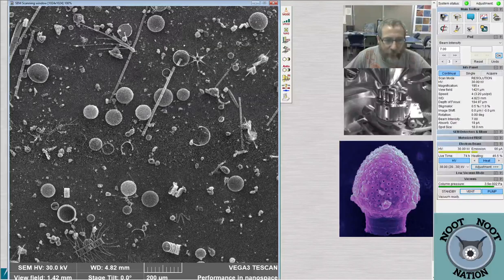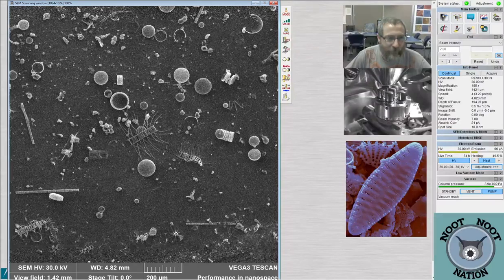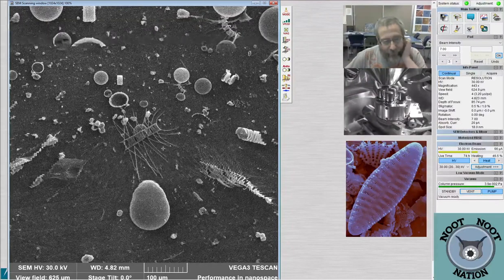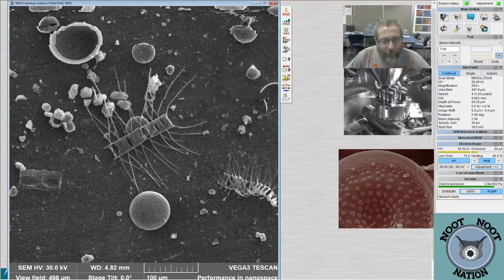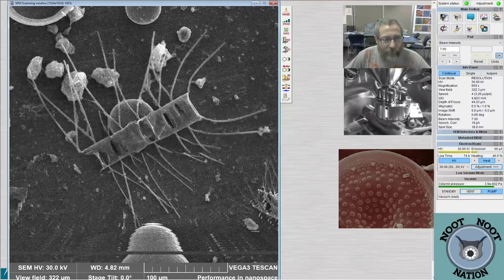The male parts, yeah, the gametes. They have flagellated gametes. It's just crazy. It's the only time that diatoms actually have flagella, and it's only part of the population that has them, part of the population for part of the life cycle.